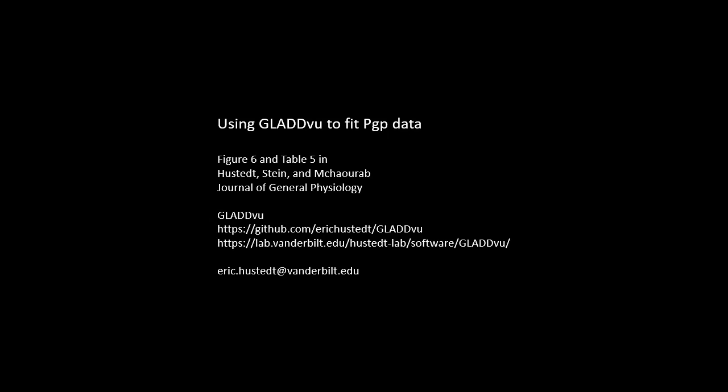In this last video, I'm going to demonstrate the use of GLADDvu to globally fit PGP data. The data sets are shown in Figure 6 of our Journal of General Physiology tutorial, and the results are shown in Table 5.